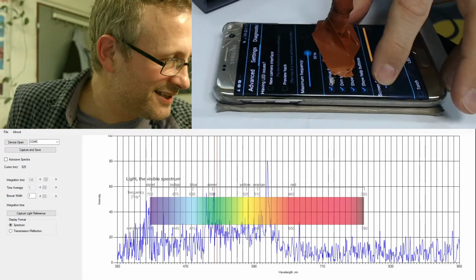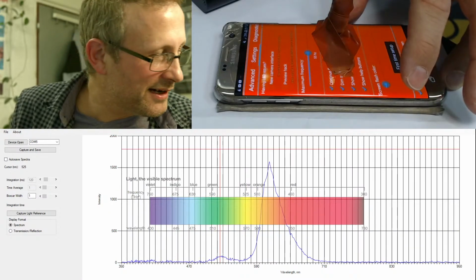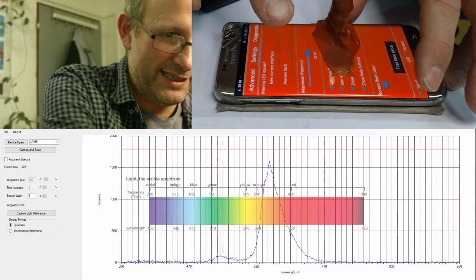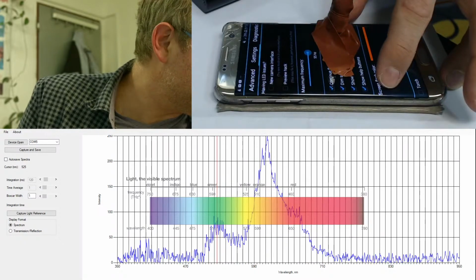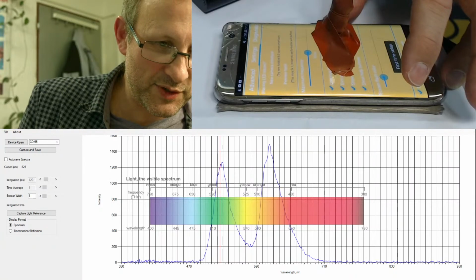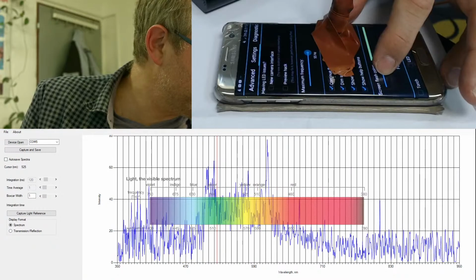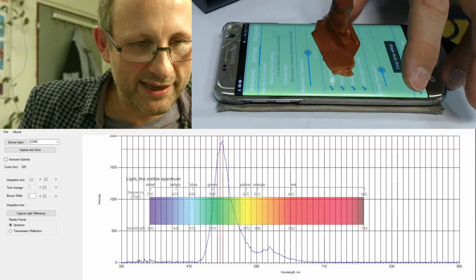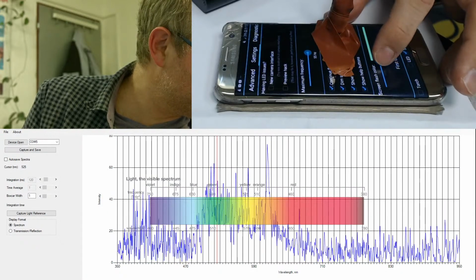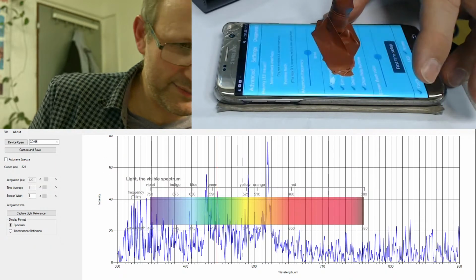This is a real strong orange down here. Okay, it looks really orange. It looks red to this camera here, but it's definitely orange. And I'm going to bring that up to more yellow. So this is a more yellow. And I'm going to bring that up to a green. We've got the green there. And I'm going to bring this up to this sort of light blue here.